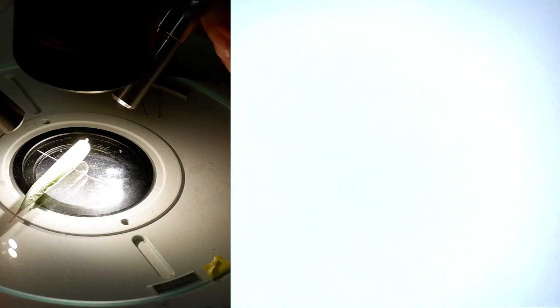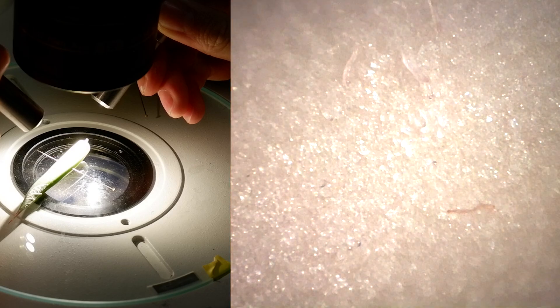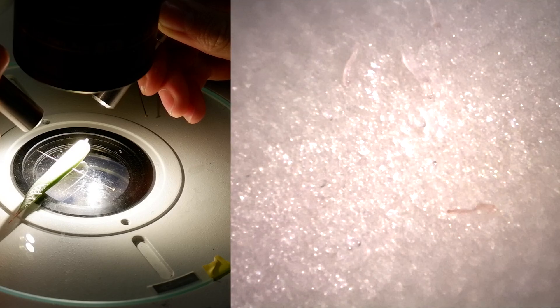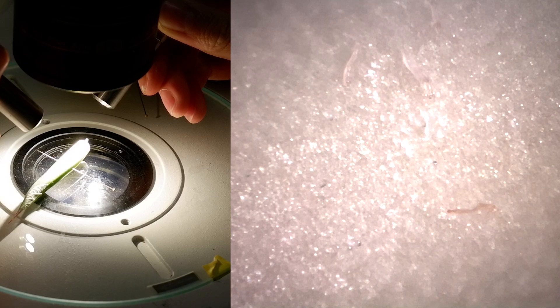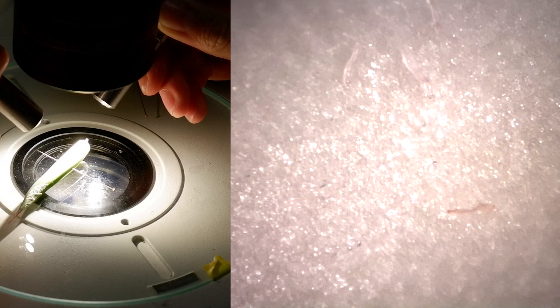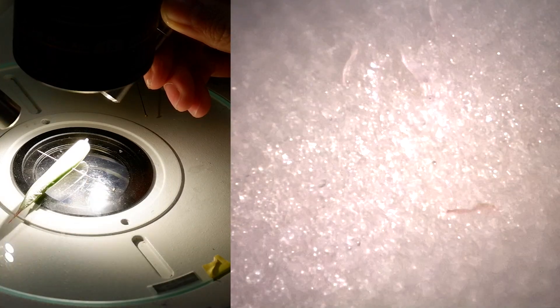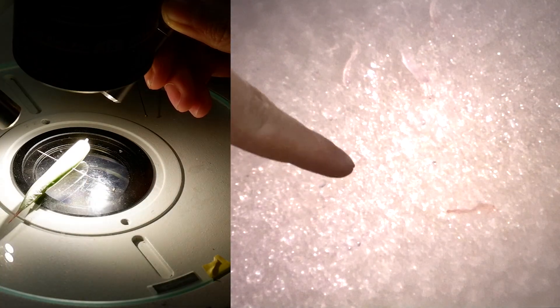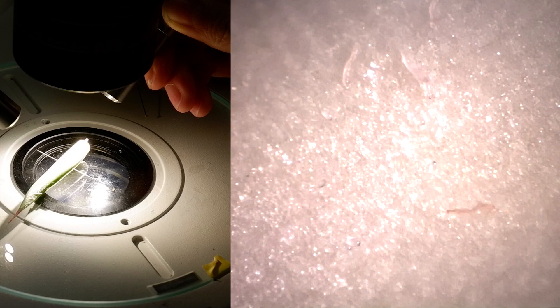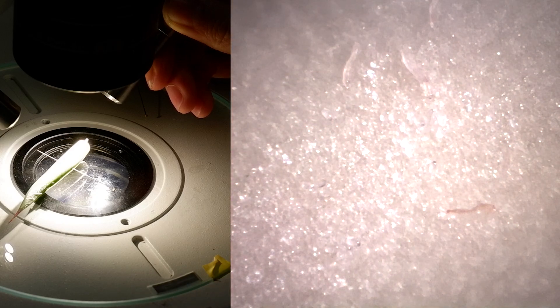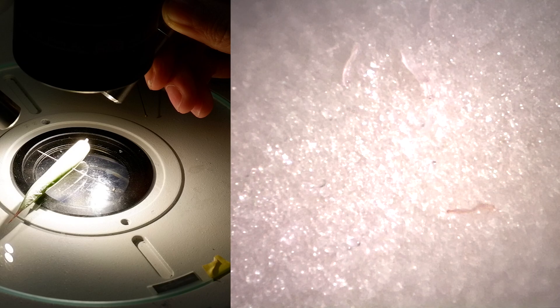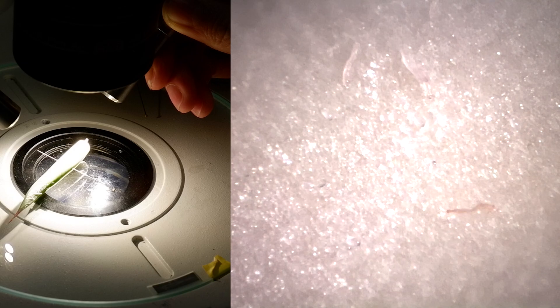Let's take a look at what it looks like with normal white light on it. You'll notice the problem is basically the same. You can see the mites, you can see some of the eggs, but there isn't a lot of contrast. And especially, you can't see the eggs that are kind of down in this section nearly as much. When it's coming to accurate counts of how many mites, how many eggs there are, it really helps to get that much stronger visual contrast.